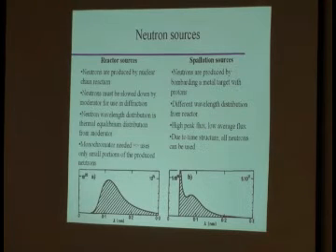You get a very different wavelength distribution, if you look at this versus this, than you get with a reactor. You have overall a lower flux than you have over here, but this has a time structure. You get a neutron pulse out.